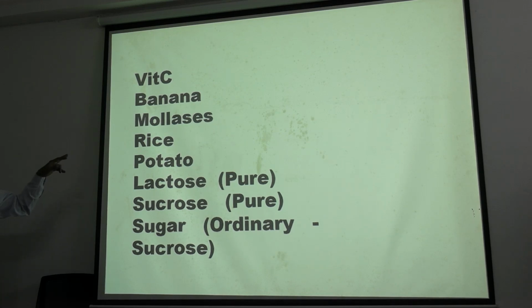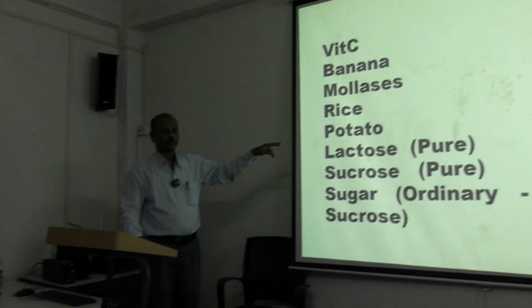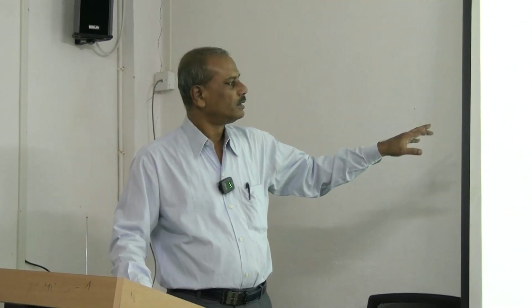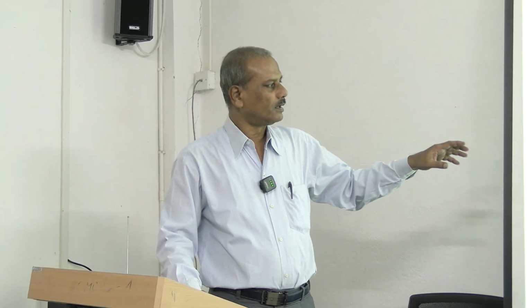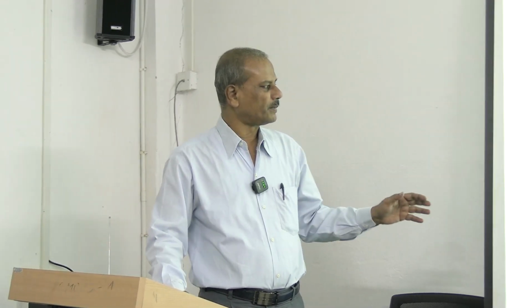Banana I have brought, I have dissolved it in water. Molasses I have brought, I will dissolve in water in front of you. Rice again I have brought from the canteen. Potato I have brought, boiled potato from the canteen. Lactose, as I told you, was brought from the microbiology department on the very first day, and that was sealed, kept in a paper packet. Similarly, sucrose in pure form from the microbiology laboratory.